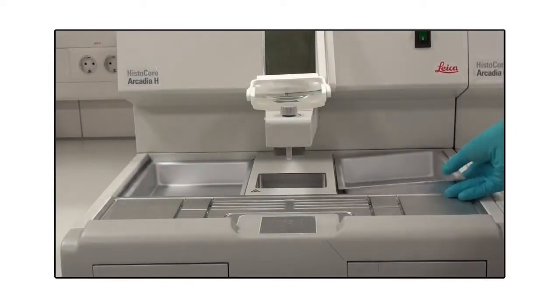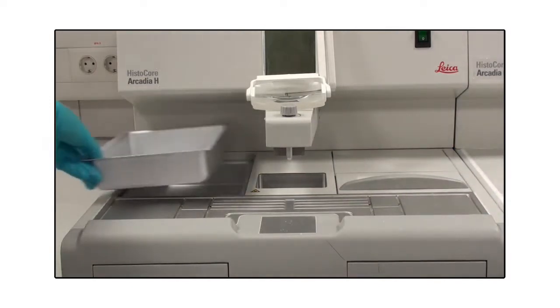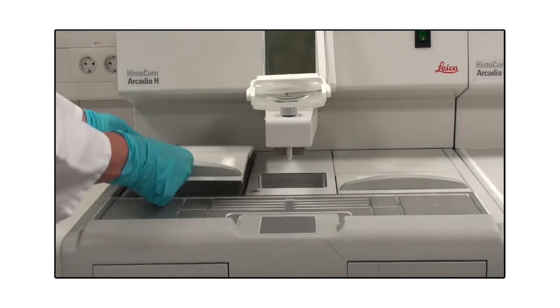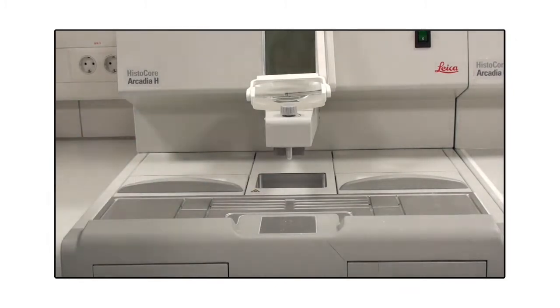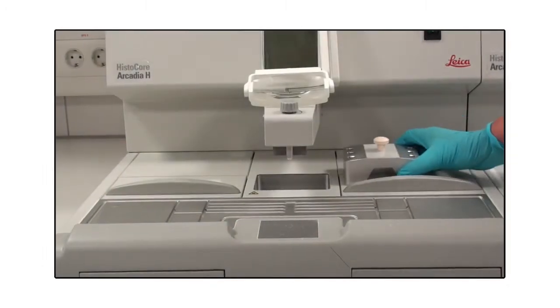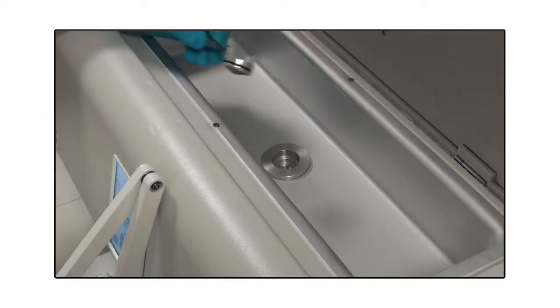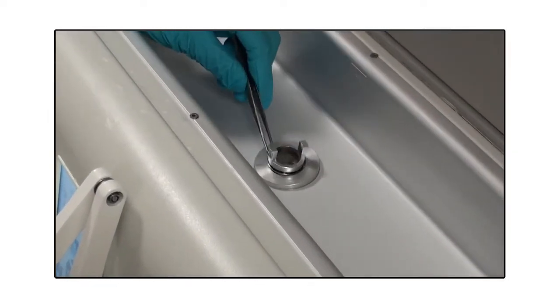Install the embedding mold tray and the cassette tray and close the trays with the corresponding lids. Depending on your preferred working direction, the two heated trays can be used for molds or cassettes. Insert the forceps holder that can hold up to six forceps. Then insert the paraffin filter holder into the outlet hole inside the paraffin tank. Check that the black O-ring seals the hole. Now connect Arcadia H and C to the power supply.